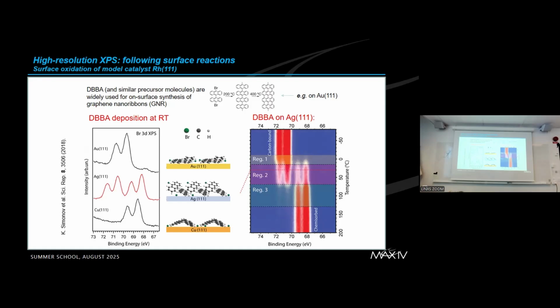I think the effect on the core levels will not be very big, unless you apply huge magnetic fields. Then the problem with magnetic fields is anyway that you cannot measure XPS at all, because in the magnetic field the electrons will be spiraling away from the analyzer.